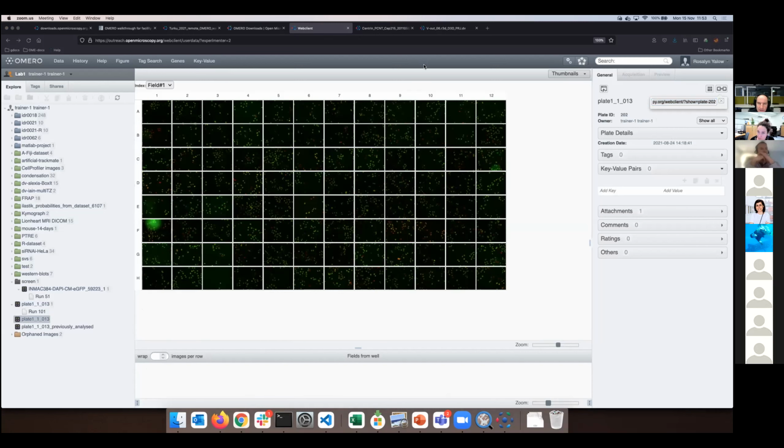You can basically link almost to any container or object, and then you simply click on that link and it will navigate exactly where I am. It will navigate exactly here in trainer one's data. You don't have to change the group and look for the user, you just click on that link and you are there. This would only work if you are logged in, obviously. If you share with somebody who doesn't have an account, that link will not work in that very specific context.